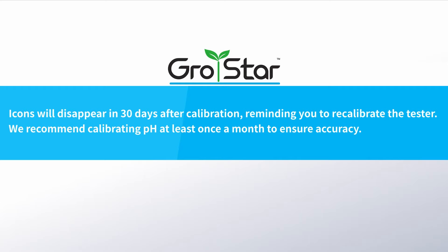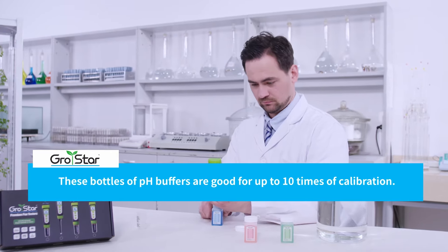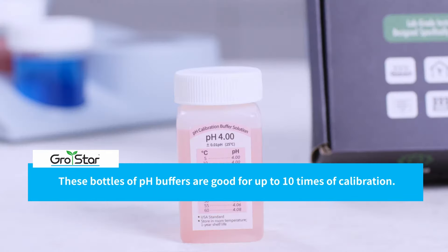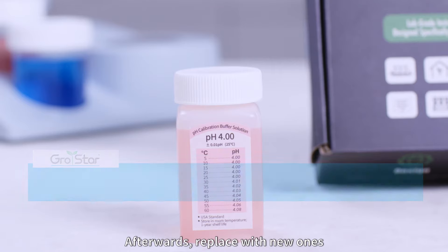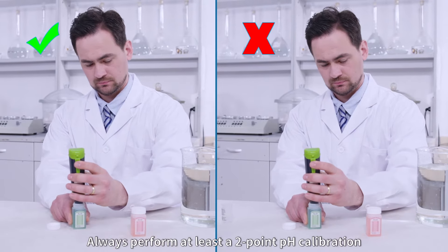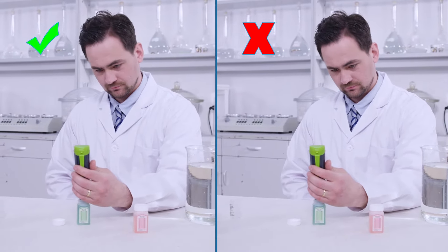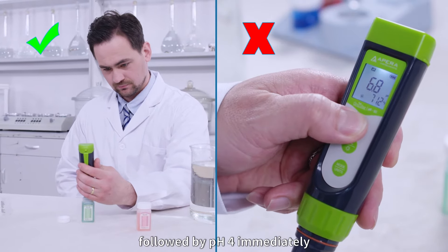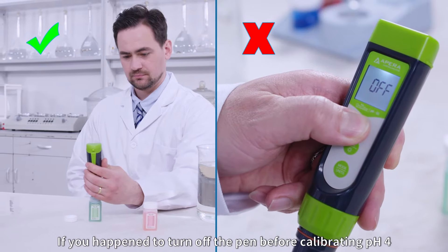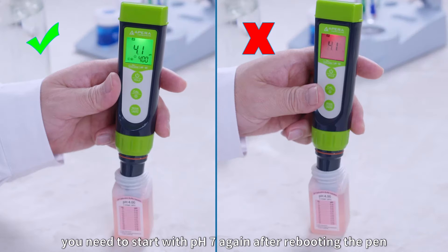We recommend calibrating pH at least once a month to ensure accuracy. These bottles of pH buffers are good for up to 10 times of pH calibration. Afterwards, replace with new ones. Always perform at least a 2-point pH calibration to ensure accuracy — start with pH 7 followed by pH 4 immediately. If you happen to turn off the pen before calibrating pH 4, you need to start with pH 7 again after rebooting the pen.